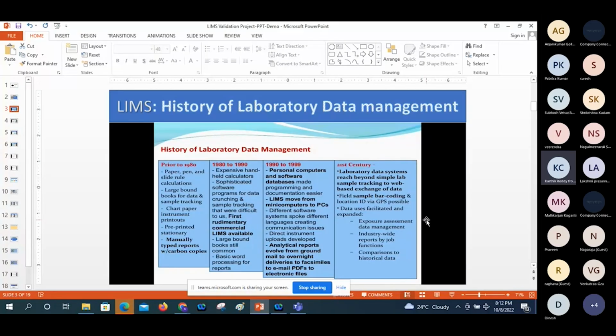So the huge revolution was coming. Different kinds of vendors are available with LIMS applications. Why? Because we need to follow the LIMS. The main advantage of LIMS is in the quality control laboratory. If you are following paper-based systems, a lot of blunders and mistakes can happen, and there is no automatic tracking of data.